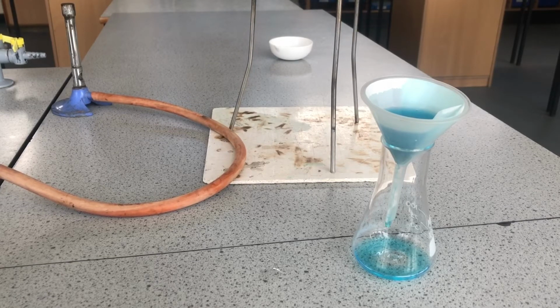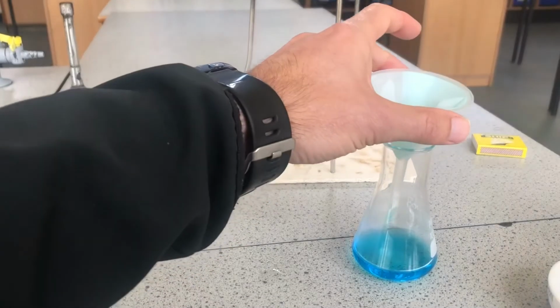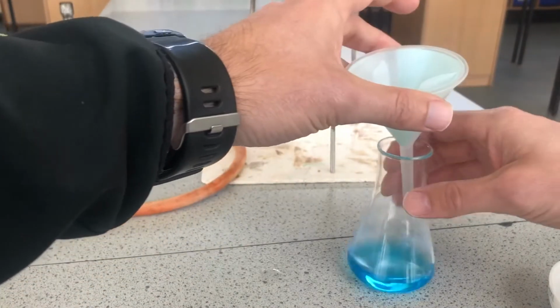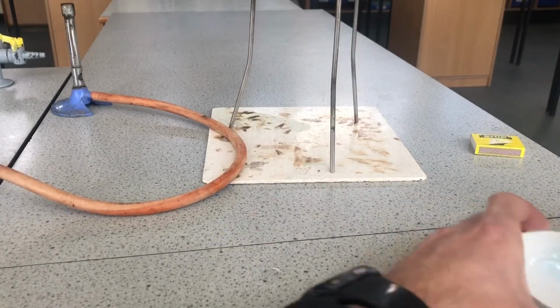And we'll now leave that filter for a minute or two until we've got enough pure copper sulfate solution in there.